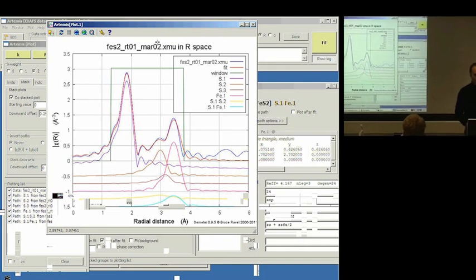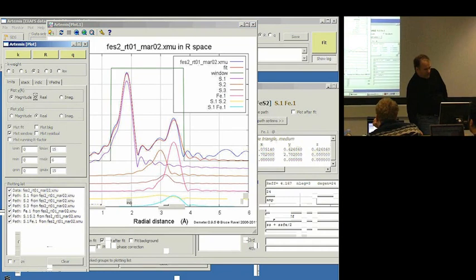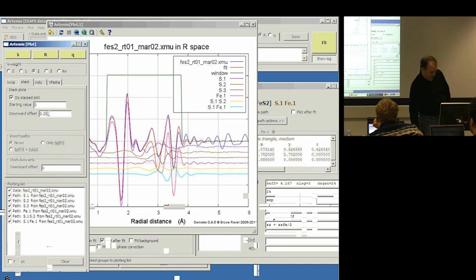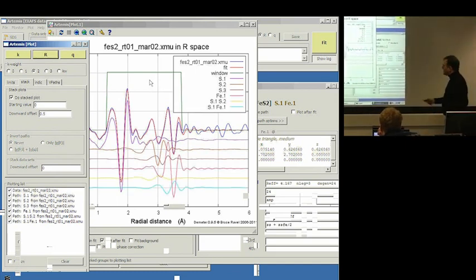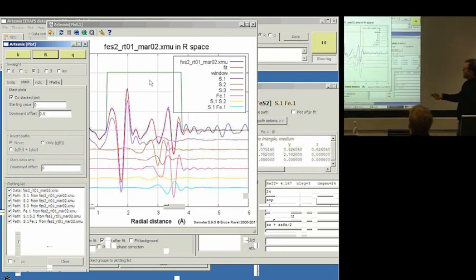How do these things add up? Well, they have some kind of phase relationship. So if we make the plot this way, and the stacking isn't enough, let's change that number. You see that we've got these interesting phase relationships between everything. So the effect of having this multiple scattering path is to take away some of the spectral weight from the iron scatterer, which is part of what helps make the red line look like the blue line in this region.